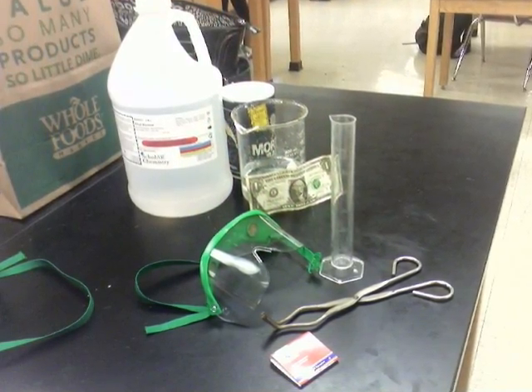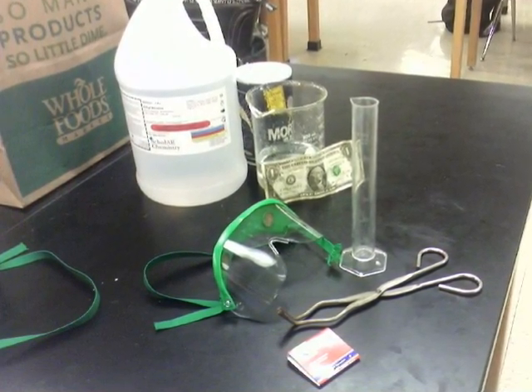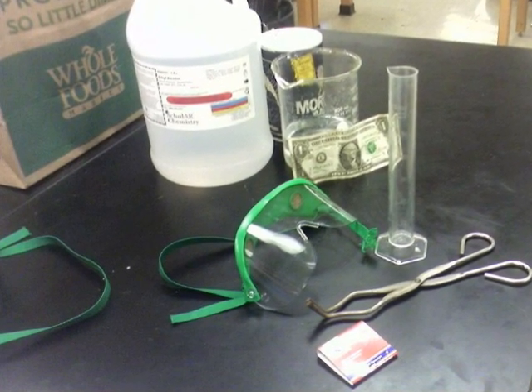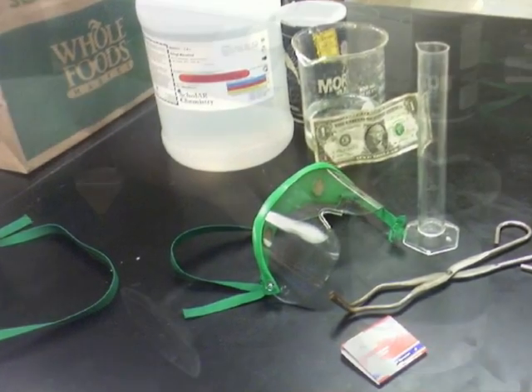To begin, you'll need to collect the following materials: safety goggles, salt, matches, tongs, ethanol, a $5 bill, a beaker, and a graduated cylinder. Be sure to ask your parents for permission before gathering these materials, and do not perform this dangerous experiment without them.